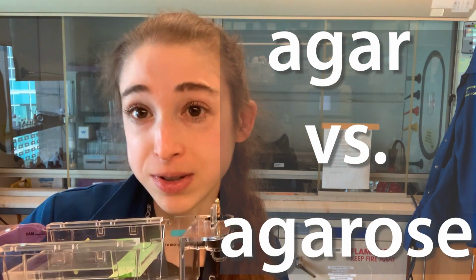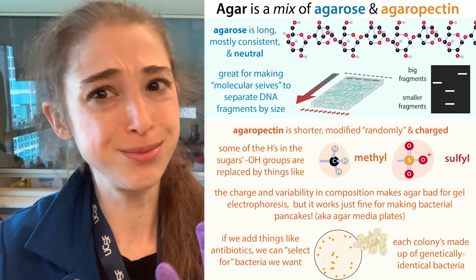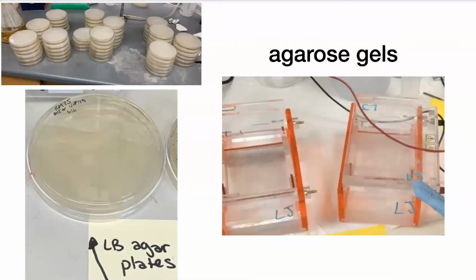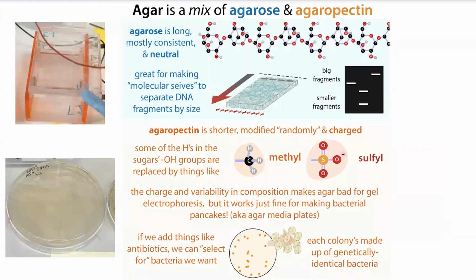Agar with agarose. Otherwise, that gel results will look pretty gross. Agar and agarose are both made up of long chains of sugar, or polysaccharides, that come from red algae or seaweed, and which we can use to make gels to, say, separate DNA fragments by size or fill with bacterial foods or media and allow bacteria to grow on them in petri dishes.